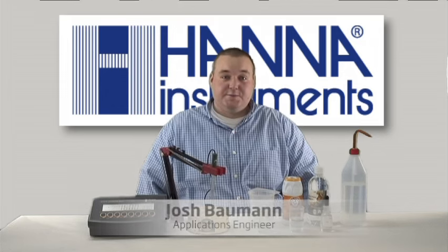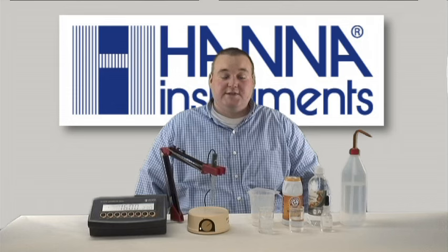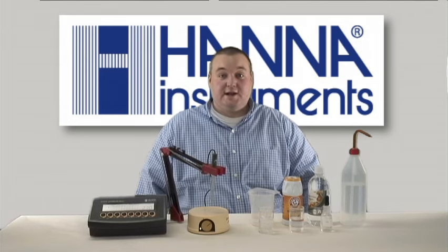Hi, my name is Josh Baumann and I'm an applications engineer at Hanna Instruments. Today I'm going to demonstrate the difference between pH and alkalinity.